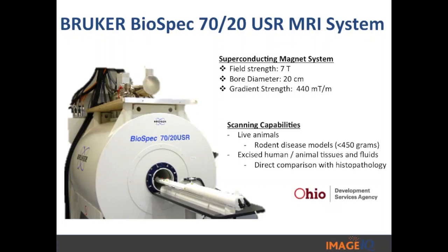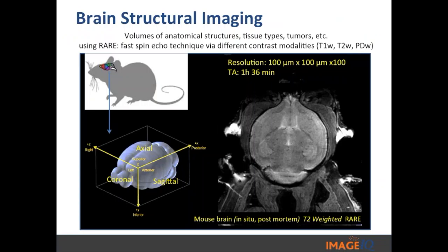Let's start looking at some images — because at the end of the day we're about imaging. Over the next few slides I'll show some basic structural imaging done over the last few months since acquiring the system. Here is a mouse brain done post-mortem — a T2-weighted RARE image done at high resolution in three dimensions: 100 microns by 100 microns by 100 microns, showing all the different features of the brain beautifully. However, it took an hour and 36 minutes. You wouldn't recommend a new user start off doing something like this.